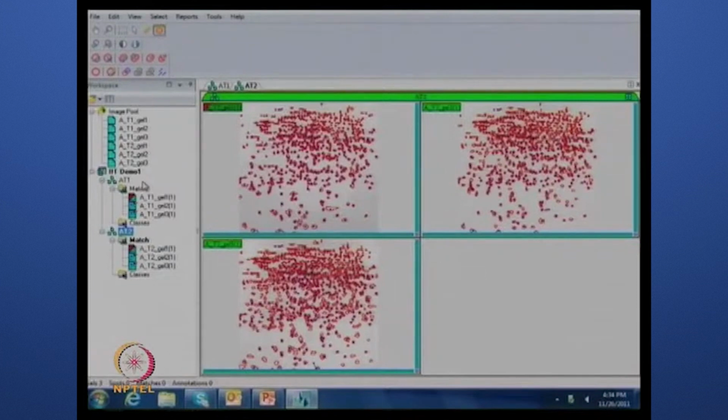Now one can do class analysis between these two classes, like inter-class and intra-class analysis. Between a control and treatment group, one can now do the statistical analysis. So now I am creating the classes here.